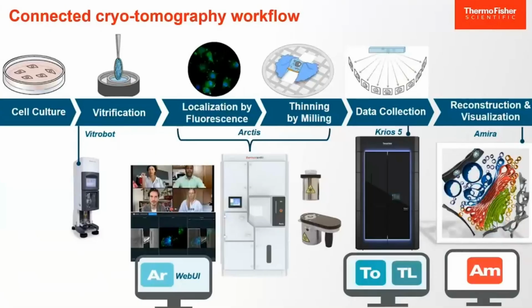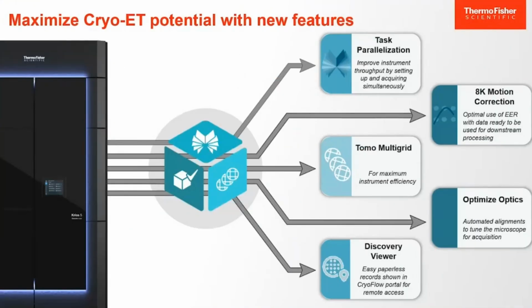And we talk about the tomography workflow. It's not only about the hardware and connecting hardware in the most optimal way, but there's also software involved, and software gets increasingly important, obviously, as I already showed in the single particle part of my presentation. Also for tomography, we've made significant steps to enhance the setup of a tomography experiment and the acquisition of experiment, and that is what I would like to talk about in the next part of my presentation.